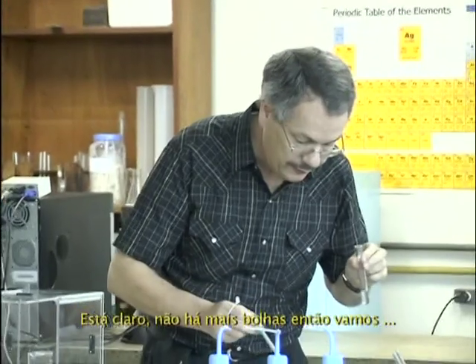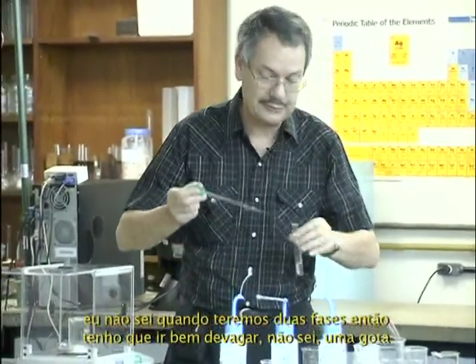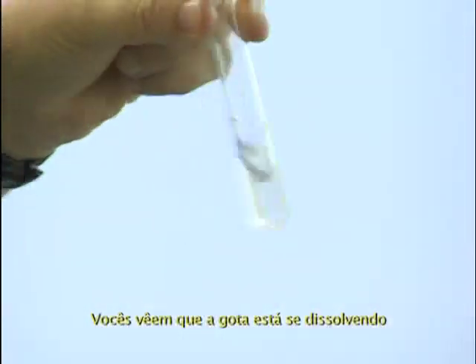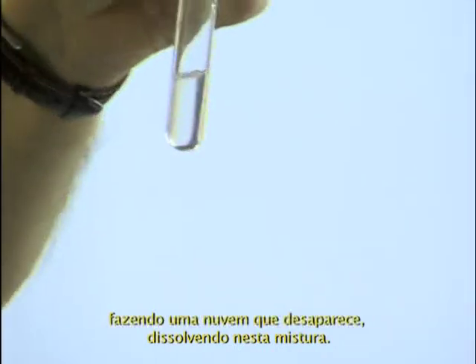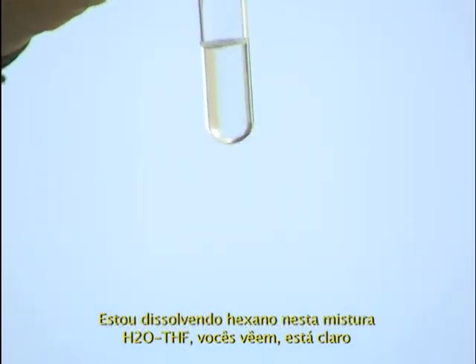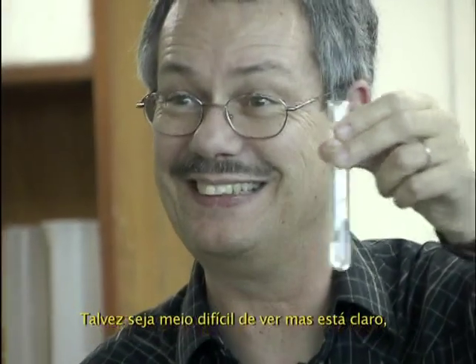So let's take, I don't know when it will make two phases, so I have to be very slow, one drop. You see the drops dissolving, making cloud, and the cloud disappears. It's solubilized. I am solubilizing hexane in this water THF mixture. It's clear. It's maybe difficult to see, but it's still clear.